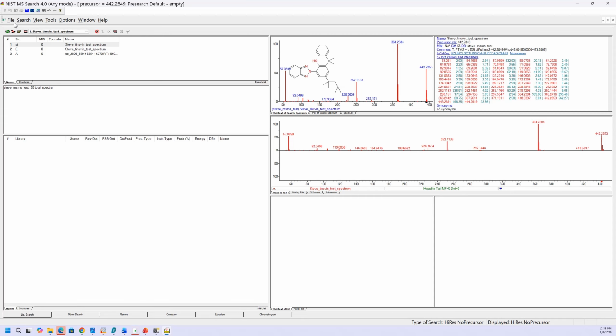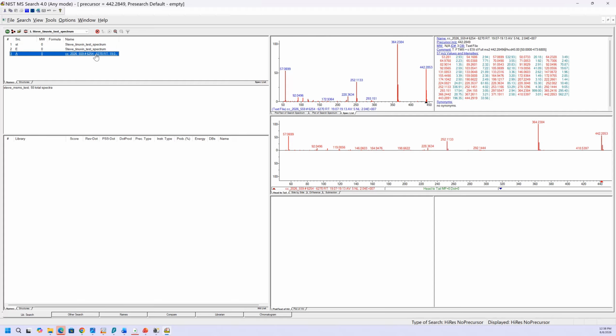And like I said, use the 55th spectrum as the spectrum to put up here in your spec list so you can search it. And it's a high resolution because that's what Kurt mainly wants to do. He'll mainly have high resolution spectra when he does things like this. So that's what I need. Let me know if you need something else.